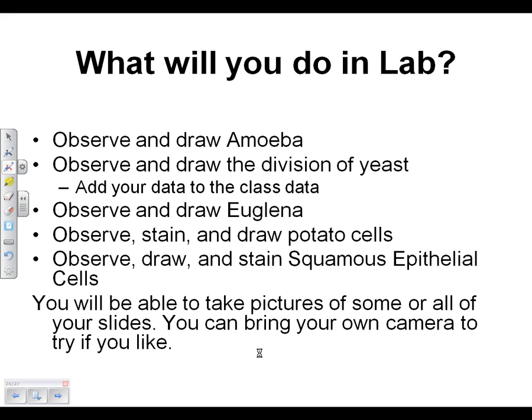If you leave them that way very long, what you will see are many exploding amoeba. So be careful with that. We'll have example ones up on the screen for you to look at, but if you're not careful, you will actually fry your amoeba and you'll see lots of exploding ones. And you'll know they're exploding because you'll see stuff streaming out of the inside of them.